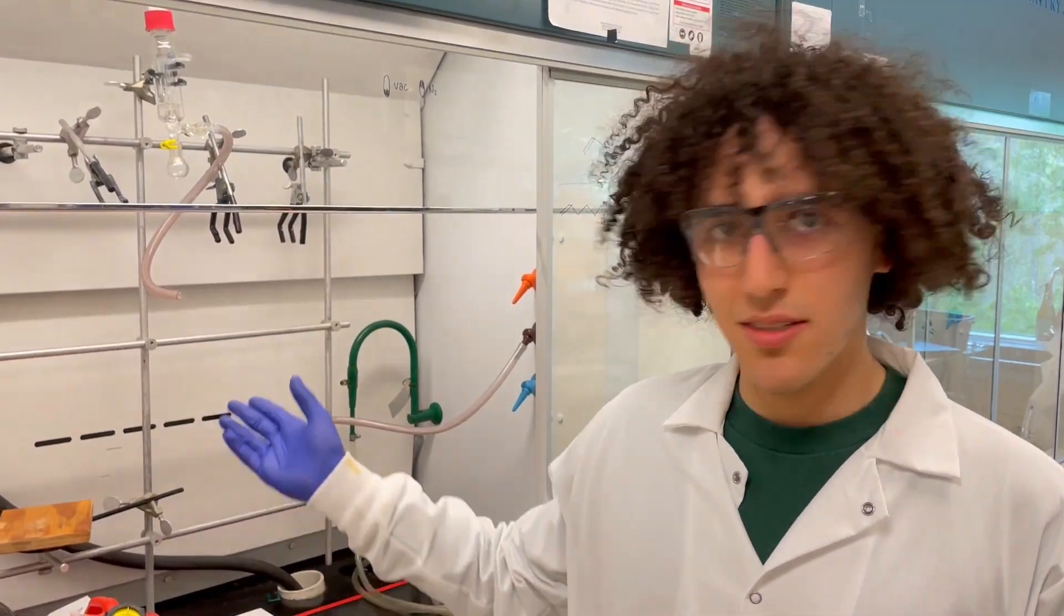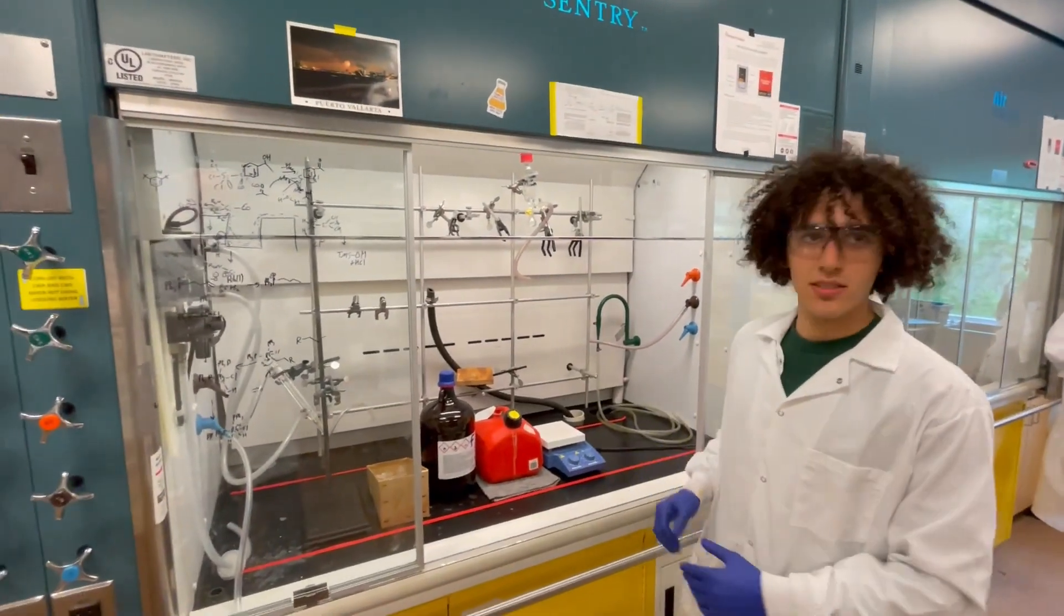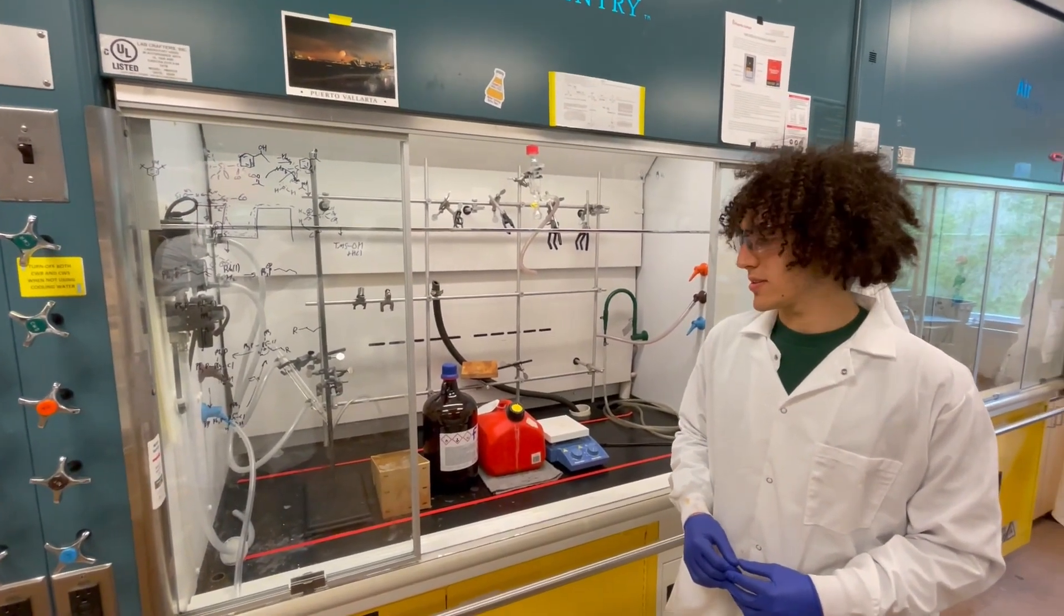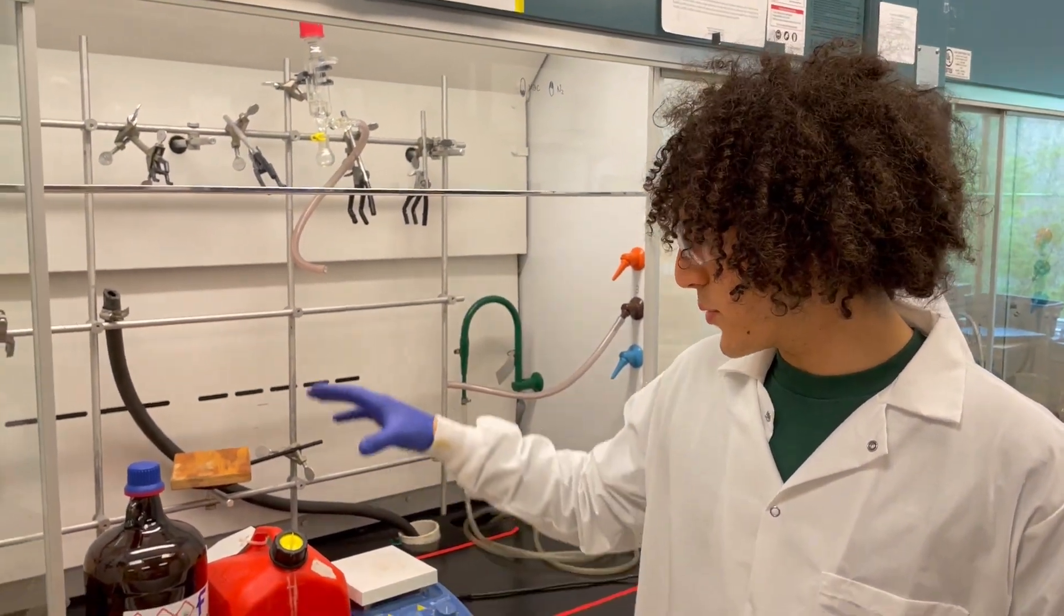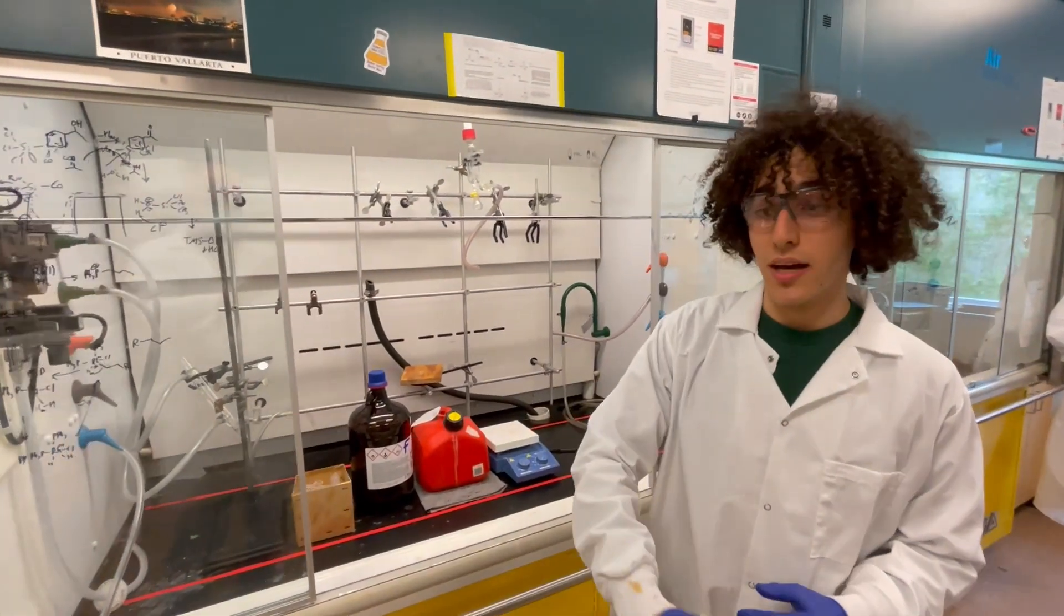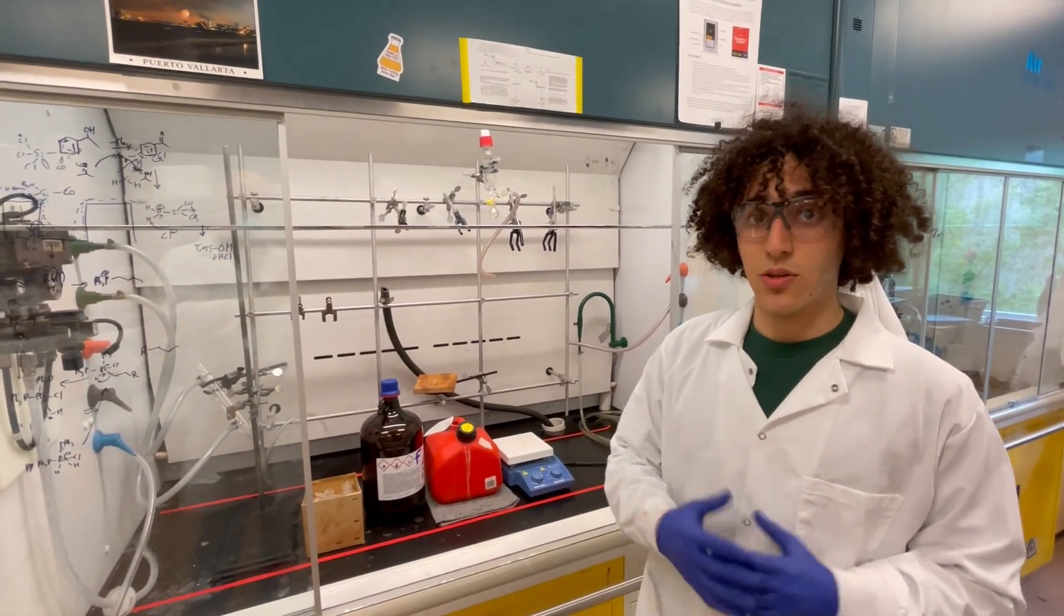Fume hoods, such as the one beside me, are semi-enclosed workspaces often found in scientific laboratories, where inside of them air circulation is maintained such that vapors produced inside the fume hood do not spill outside, as this may present a risk to researchers.